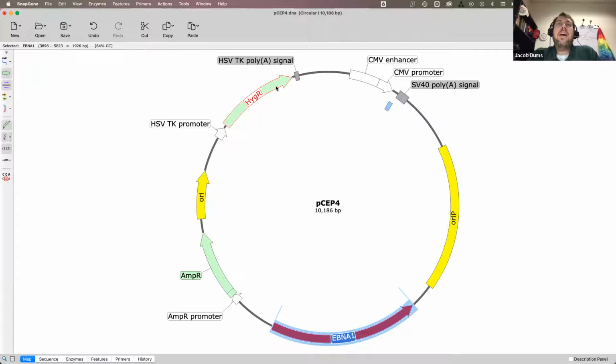And then notice that the protein coding sequence we have, but in order to complete the genetic circuit, we also have to have both the promoter and terminator that are required for this to be properly transcribed.